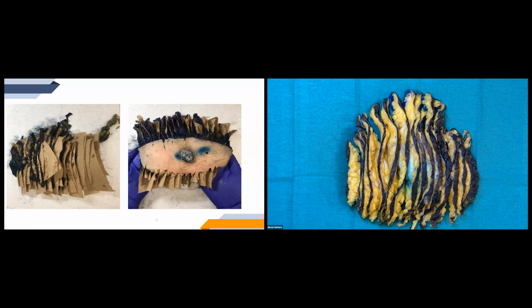Here we have some photos of the aftermath of that. One photo shows the posterior aspect and the other shows the anterior aspect. You can see that the skin is primarily intact. I've just cut through a little bit on the inferior and superior aspects, and that's completely fine. The main thing we want to avoid is cutting all the way through the skin, because then you're going to have floating bits of breast tissue in the specimen container. It's going to be really difficult for the person grossing the case to know exactly where those tissue pieces came from. When we're talking about fresh tissue, it's also important to understand the CAP guidelines associated with it.